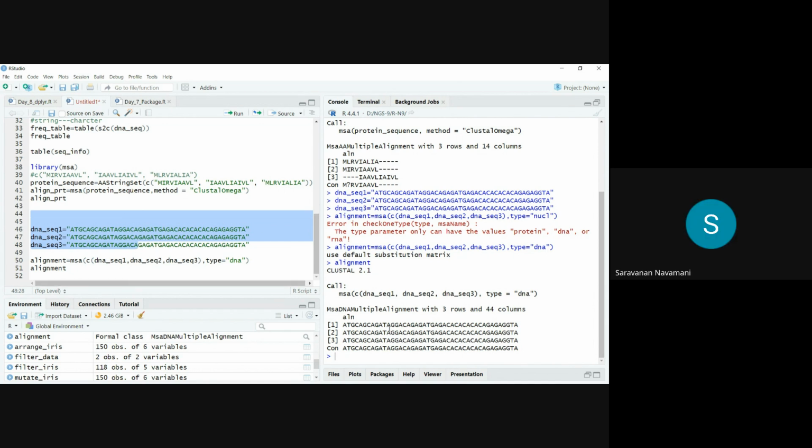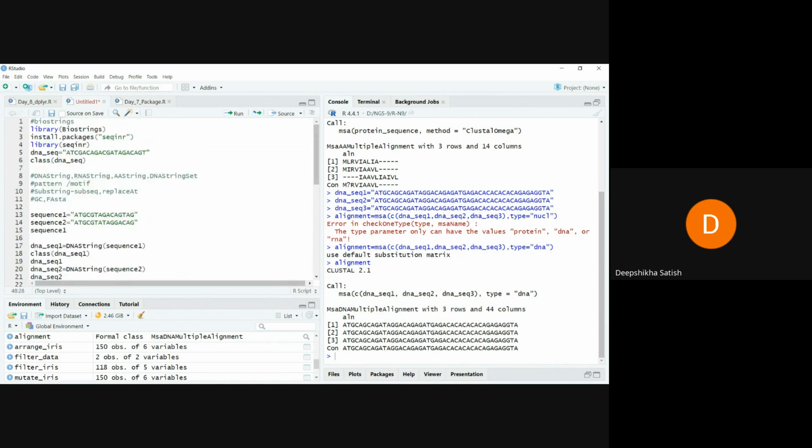And one more thing, what is the command for the package MSA? Install MSA? No, no, MSA is from Bioconductor, so install.packages will not work. You have to go to a browser, or if you have the command for Bioconductor installation, BiocManager, you can just use that. So via BiocManager we need to do it, correct? Yes, not CRAN. You have to write that whole command from Bioconductor.